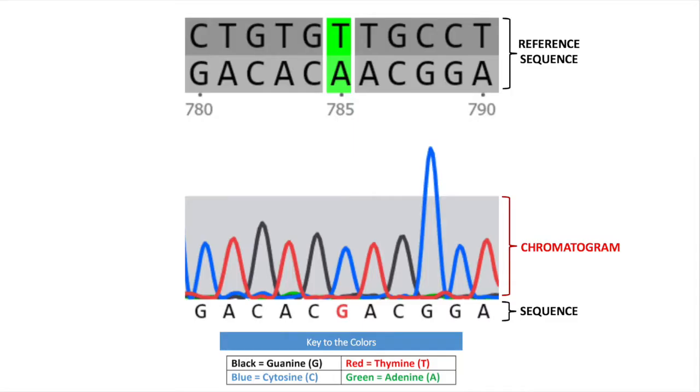And now on to Genome Compiler itself. Genome Compiler is a tool that will allow us to look at both the letters, the sequences, of our DNA fragments, as well as a related trace file called a chromatogram. Chromatograms tell us how confident the sequencing computer was when it identified a particular base at a given location in a DNA fragment. It uses color-coded peaks to designate a particular nucleotide.